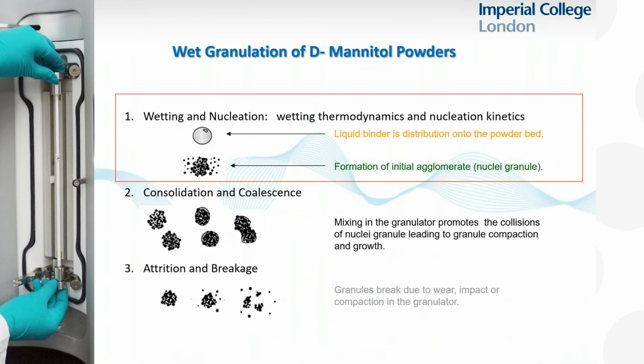So the final example I think I've got today is really around granulation. Wet granulation of powders is an important process by which we will take small particles and make larger granules or agglomerates. The first stage is to take the powder and to spray it with a liquid. Typically, it's called a binder solution. It's typically aqueous-based, may contain a polymer such as PVP, and that liquid will wet our powders and granules will then form. And we're particularly interested in understanding, will our liquid droplet wet or not wet the powder? And if the powder has different wettability, will it affect the granules that I end up with? And that's what we're going to concentrate on for the last 5 minutes of the presentation today.